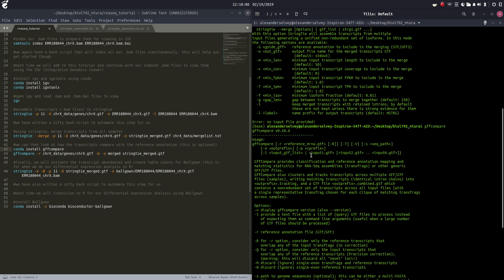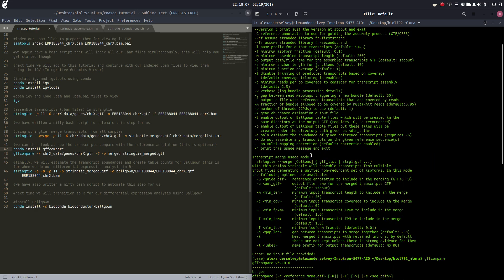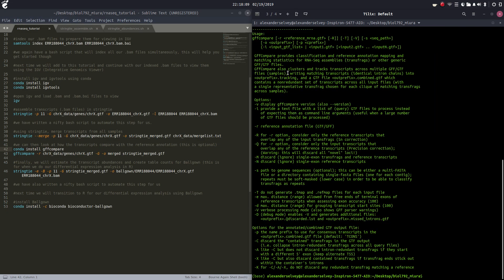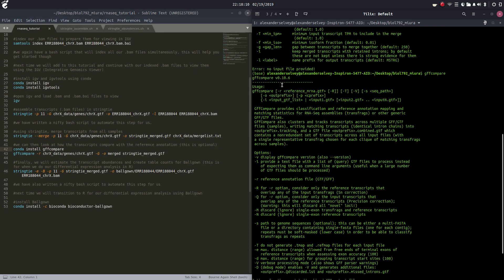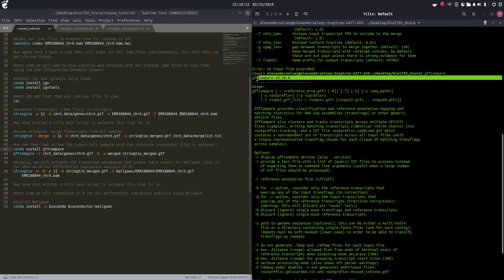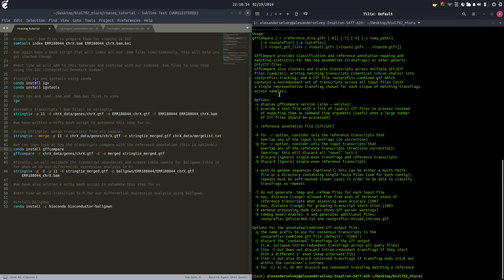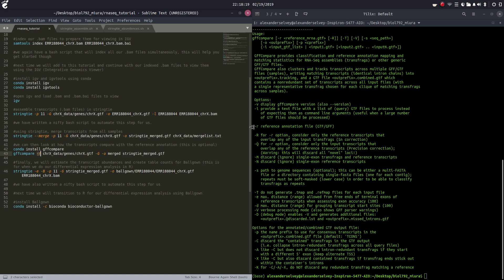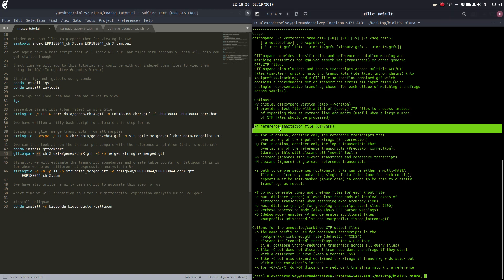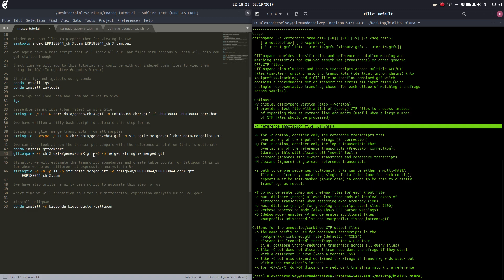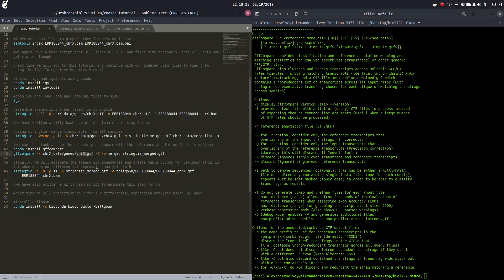Let's come back up here and look at our gffcompare user manual. Here is our user manual for gffcompare. Dash-r is the reference annotation file, which will be our chromosome X GTF file.